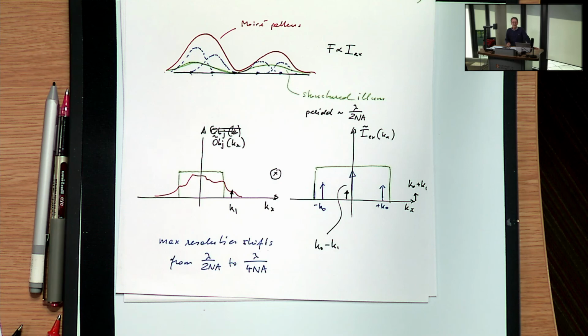Well, first of all, you gain that resolution in X, in Y, and you can gain it in Z too. So if you have a voxel of volume V, a factor 2 by 2 by 2 gives you a factor of 8, almost a factor of 10 reduction in the voxel size. And for many imaging applications, that is more than enough.